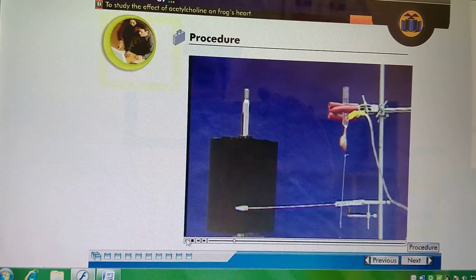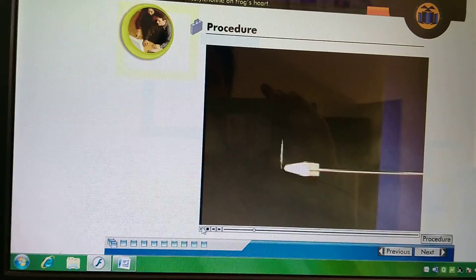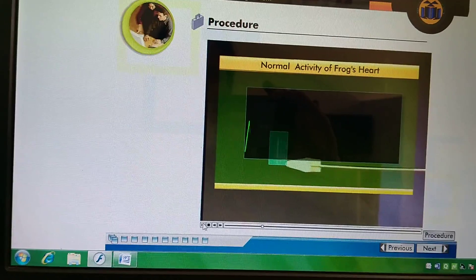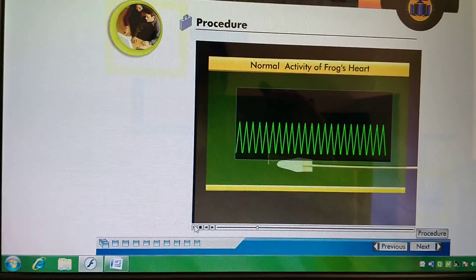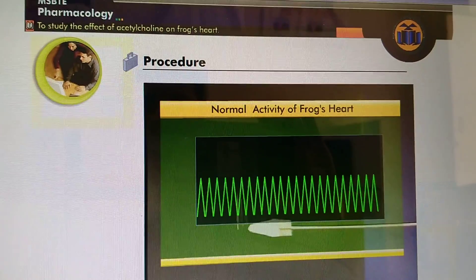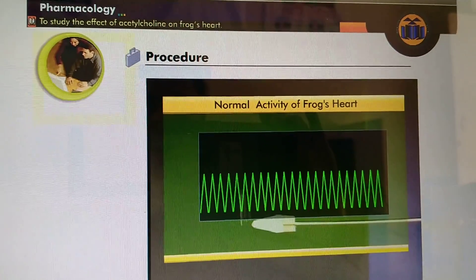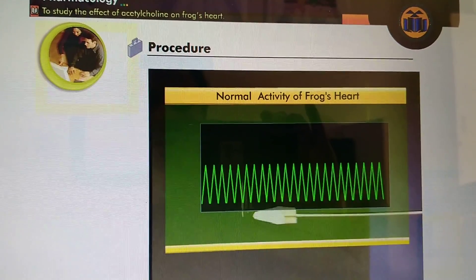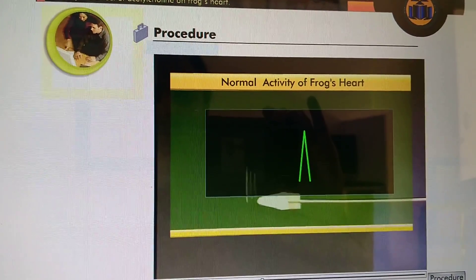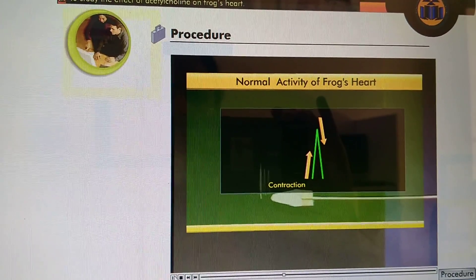Start the drum and record normal contractions of the heart on smoked paper for one minute. From the pattern recorded on the drum, you can see contractions of cardiac muscle and relaxation of the same. This event of contraction and relaxation is observed in the form of a single peak. The upgoing part of the peak represents muscle contraction and the reverse indicates relaxation.